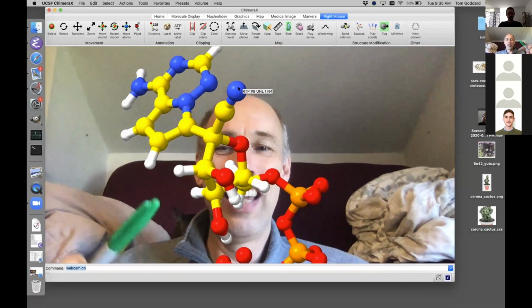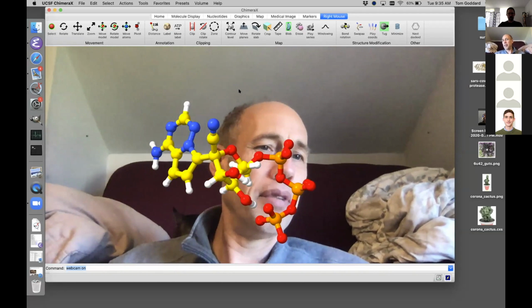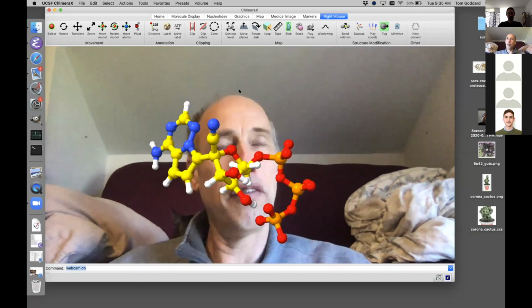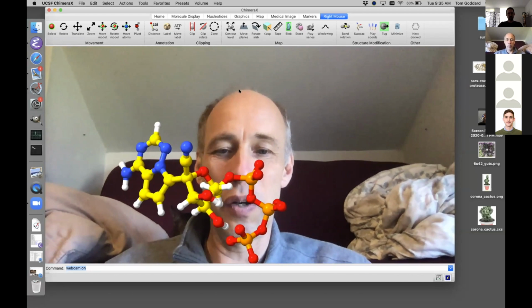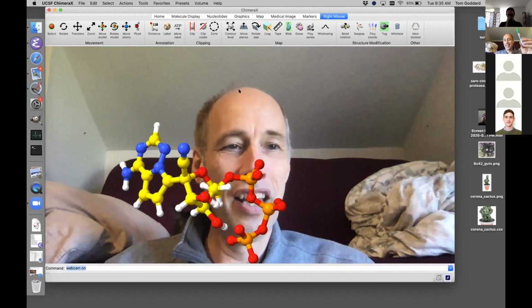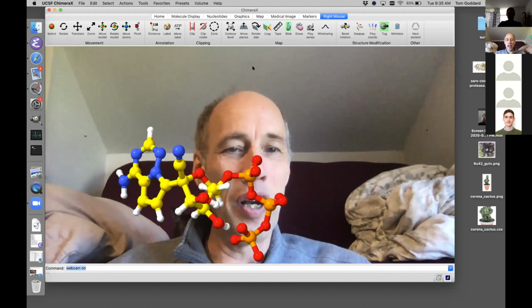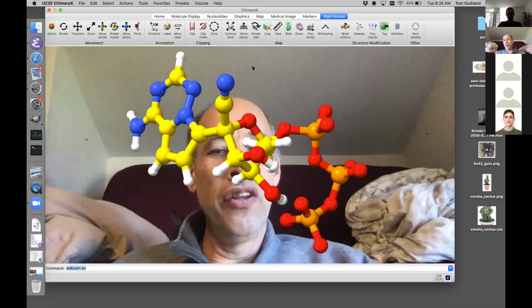Okay, so this was all done just with my laptop. Not too much different from what I just showed you with all the fancy VR equipment. One thing you'll notice is I was using this pen to point. And the reason why is, notice I'm entirely behind the molecule.